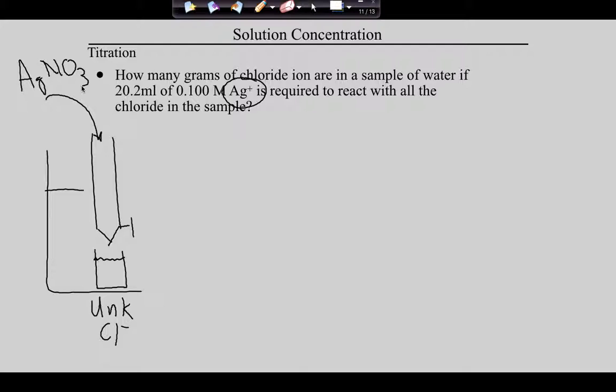There's no reason to include the spectator because it's not doing chemistry, but when we go in the lab to do this actual process, you can't grab a bottle of silver ion solution. You can grab a bottle of silver nitrate solution, and that's what you're actually working with. So, guys, imagine this. Imagine that we then add, drop by drop, silver nitrate solution to this unknown solution of chloride ion. Guys, what are we going to see down in the beaker?